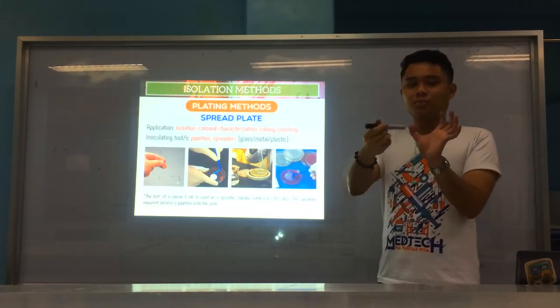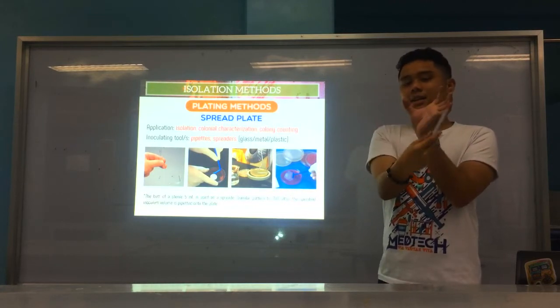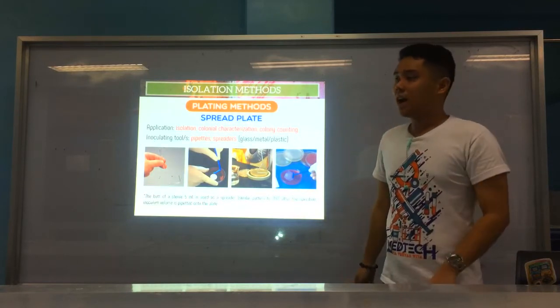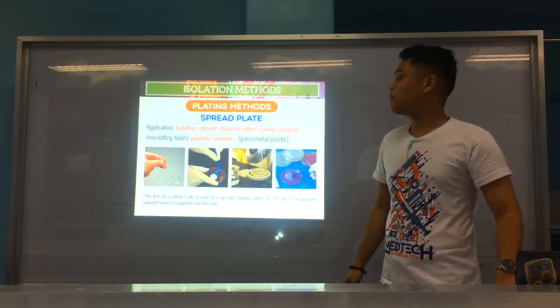So, you plate, right? Up, down, and then streak, and then twist the plate, streak again for the second layer, and then twist lastly for the third layer. Okay? Again, we have a video explaining that. Don't worry. Alright, so that's your spread plate.